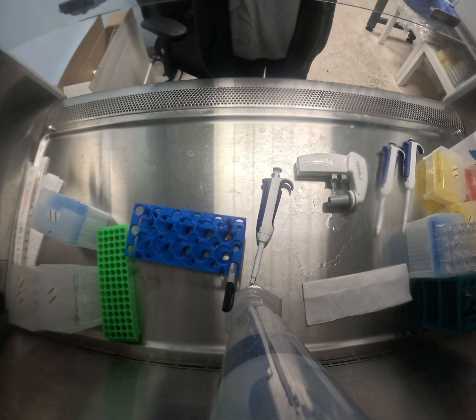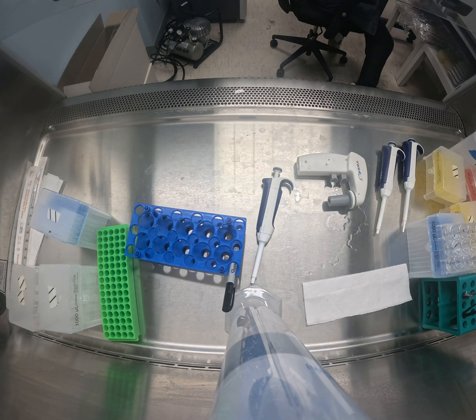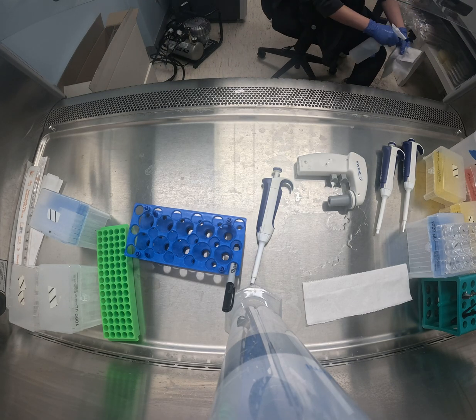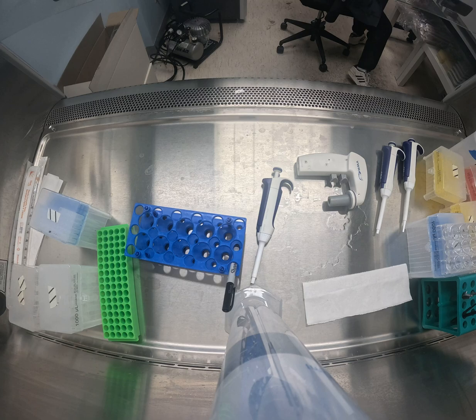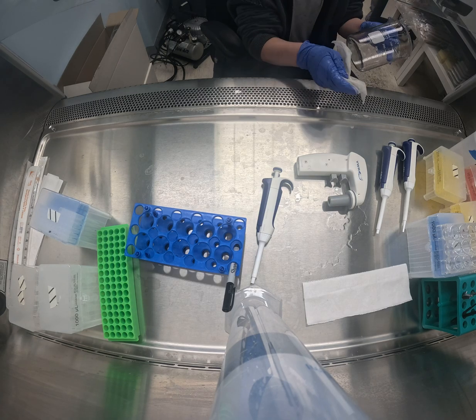To get started with any culture or passage procedure, the first thing you're always going to do is open the flow hood, set up your bench, and organize everything you need for today. Ensure that anytime you clean items off to bring into the flow hood, everything is disinfected and thoroughly wiped with a paper towel drenched in alcohol.